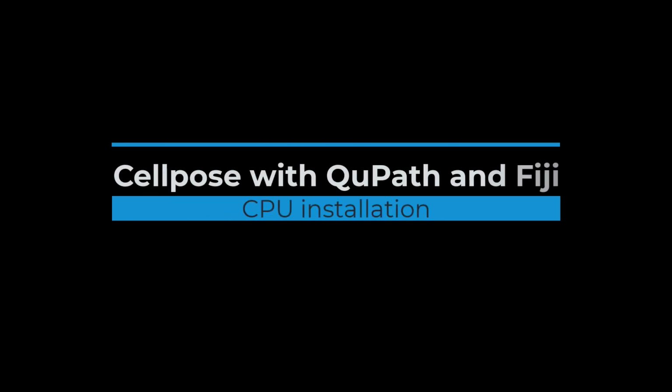In this video, I'm going to show you how to install Cellpose to be used with QuPath or Fiji. There are many ways to do it. I'm going to show you one that is not too difficult to do and that should work with any environment.